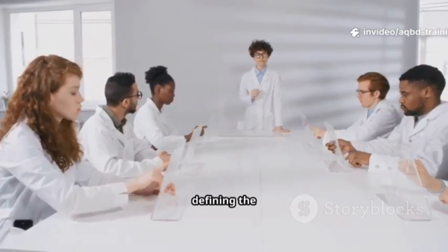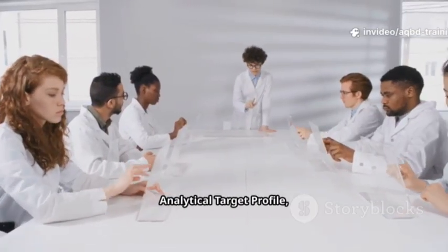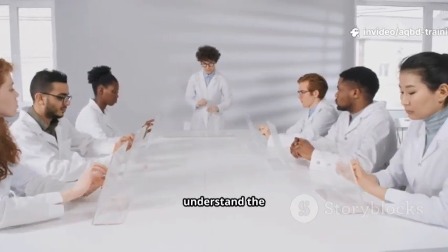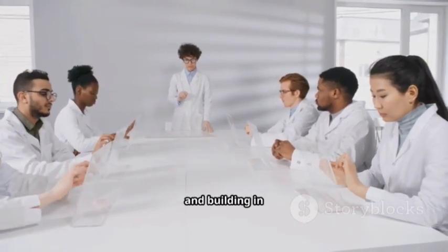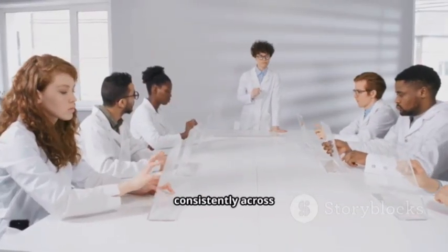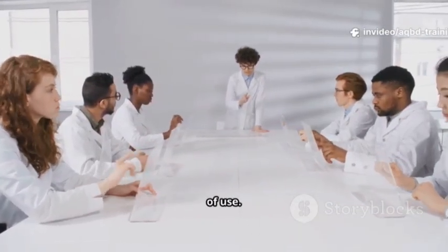AQbD begins with defining the analytical target profile, conducting thorough risk assessment, using designed experiments to understand the method design space, and building in robustness from the start. The result is a method that performs consistently across its intended range of use.